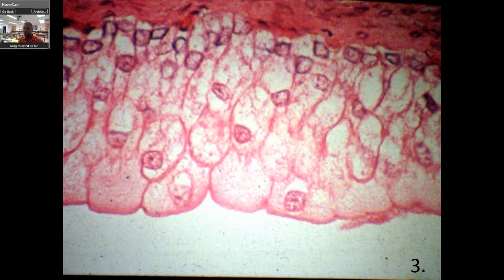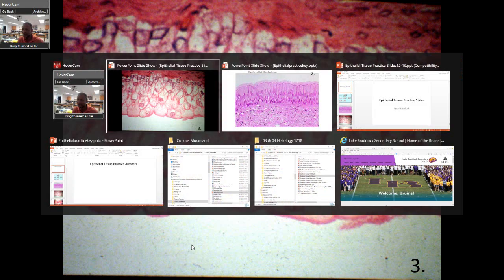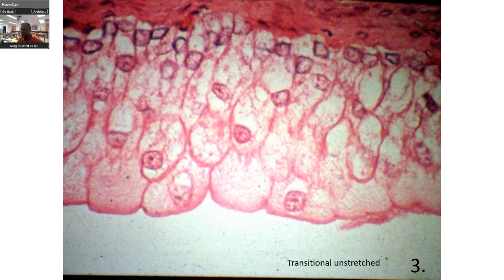Here's number three — take a second. This is kind of upside down. Here's your basement membrane, here's your apical surface, and here's the lumen. This is transitional epithelium, and it's unstretched. How do you know unstretched versus stretched? If it was stretched, these cells would be flat. These top cells near the apical surface are called dome cells. If stretched, this would be flat — like a full bladder. This is an empty bladder.